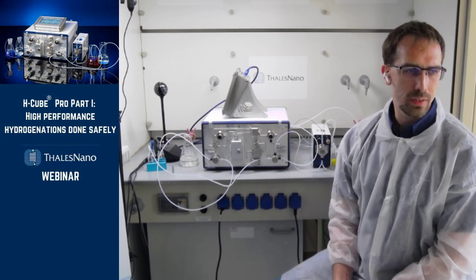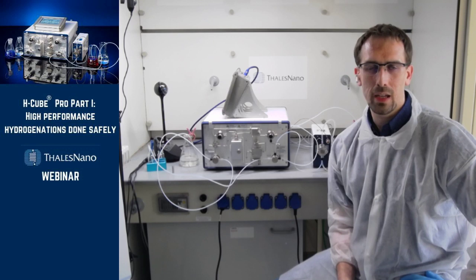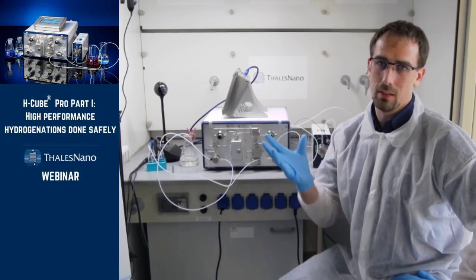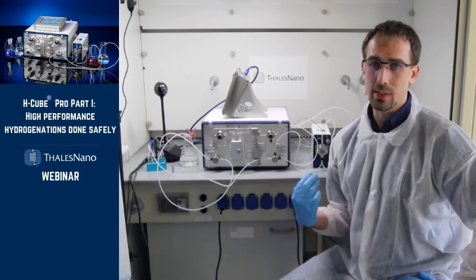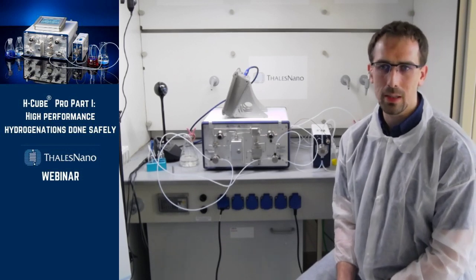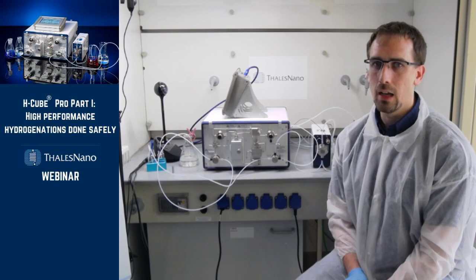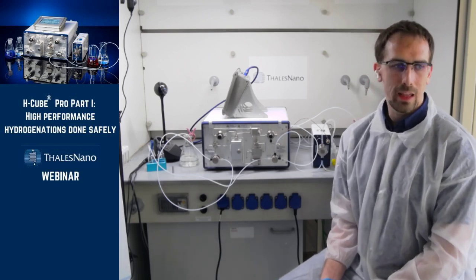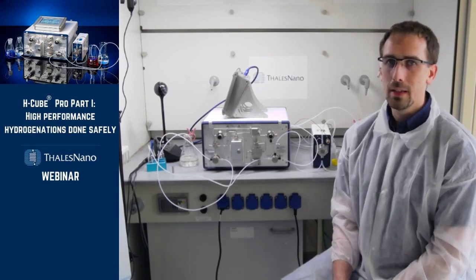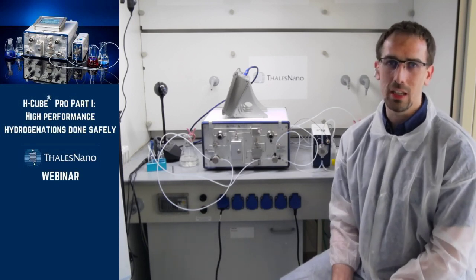When do we have to replace the water from the tank? If we keep water for a longer time, it can damage my electrodes. So if you don't use your instrument for a couple of weeks, it is recommended to replace the water, because otherwise, even if you started with high quality Milli-Q water, for example, after some time biological organisms would start to live there. If you use your instrument on a regular basis, you would anyway consume the water inside. And please always make sure that you keep it clean. The water tank has a little cap on the top, which should be left there, so no solid particles can fall into the water tank.